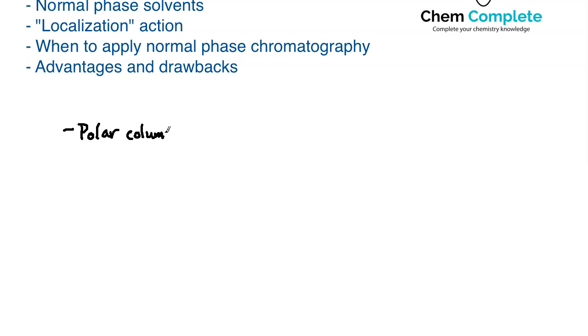Okay, so if you remember in the discussions revolving around reverse phase HPLC, we had the opposite setup with a nonpolar column. We were talking about things like C18 columns with long hydrocarbon chains modified onto a silica base. Whereas now we are talking about a polar column instead of a nonpolar column, right? So this is going to be a polar column, which again, the stationary phase of the separatory process is polar in normal HPLC.